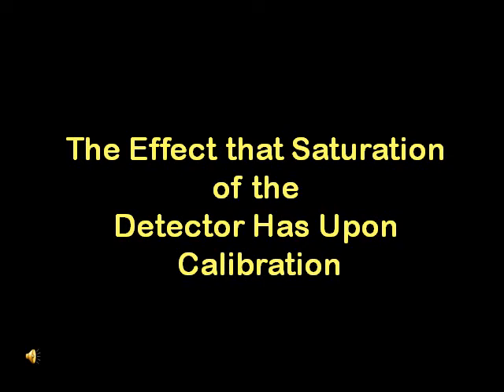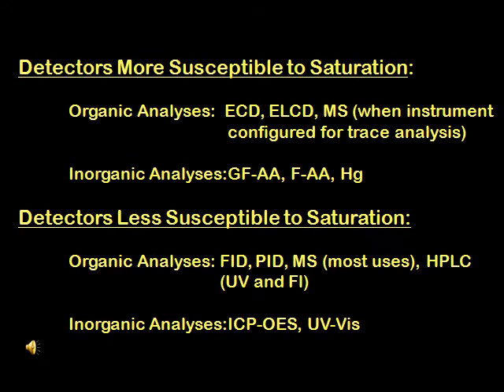In this section, we will talk about the effect that saturation of the detector has upon calibration. Most analytical detectors at some point will begin to show the signs of saturation, quenching, or self-absorption of the response when the detector is overloaded.